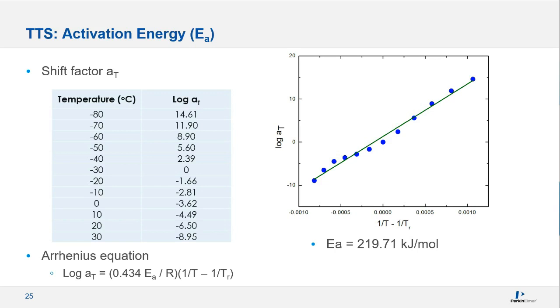As the activation energy values depend on the molecular parameters of the polymers, they can be used as a probe of changes in polymer structure. For example, changes in molar ratio of series of copolymers will have a corresponding change in the activation energy.